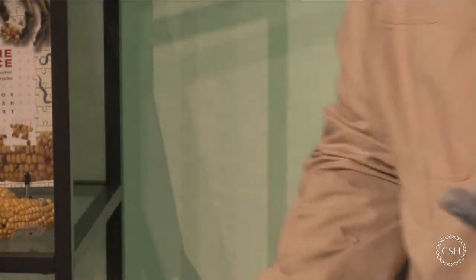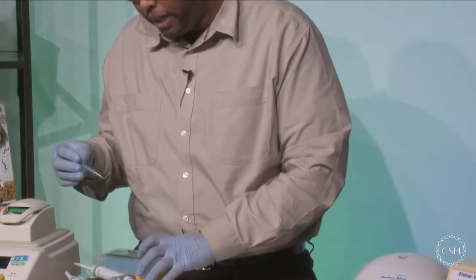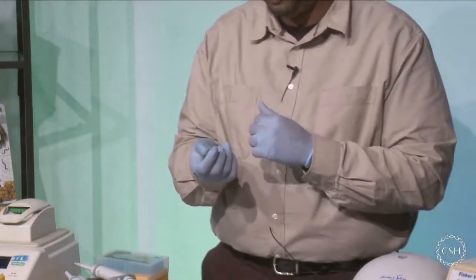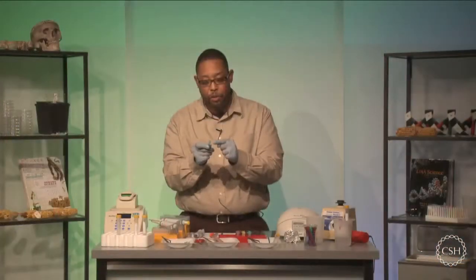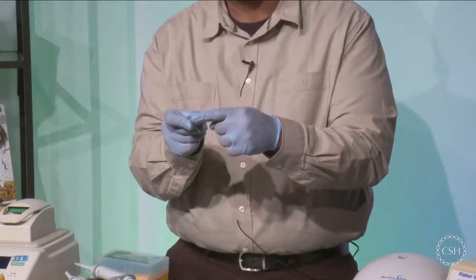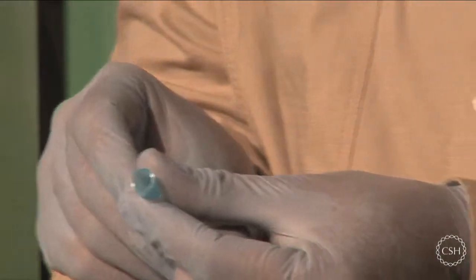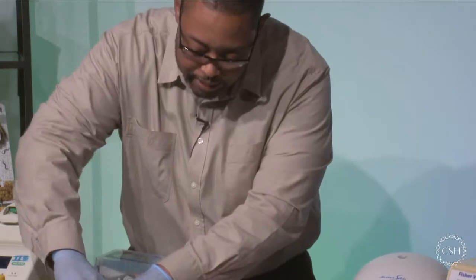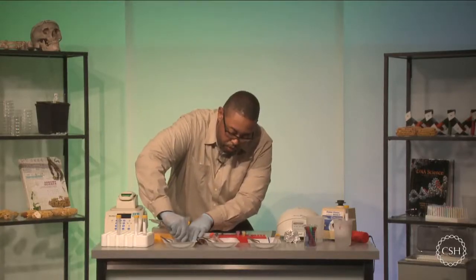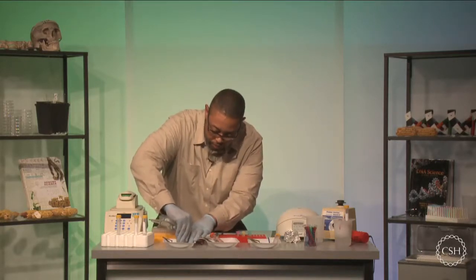Okay? But I'm just going to collect some tissue from this plant here. And typically from a plant, what I like to do is collect a hole punch, and I don't want to go making a whole bunch of different types of hole punches available to me. So I'm going to take a sterile tip out of my tip box, and I'm going to use just this large opening here in the front to punch a hole into my physical tissue here. So I'm going to move over to my tissue, and I'm just going to press down into that tissue really hard and make just a twist or a circular motion. And the idea is to create just a punch of that tissue.